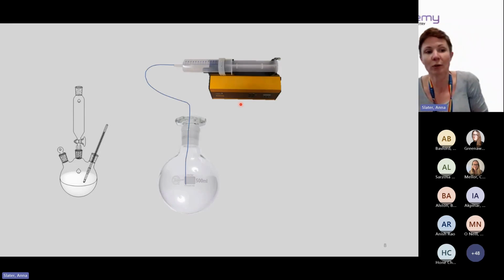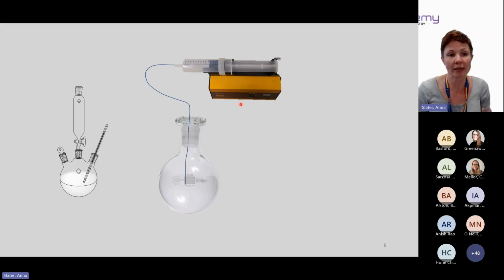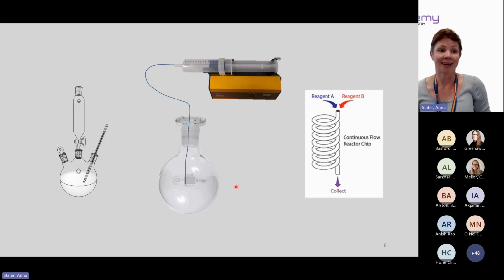What you want to do, if you want to control your relative concentrations or your mixing, or you might want to go to high dilution, a very typical supramolecular chemistry technique, is to use slow addition or high dilution, where you're essentially controlling the addition of one of your components to the other. And really all I'm saying is perhaps you might get even better control if you move to a fully continuous process where you're adding your two reagents, mixing them at a controlled point, letting them pass through a heated reactive zone and collecting at the end. That might give you even better control over your process.